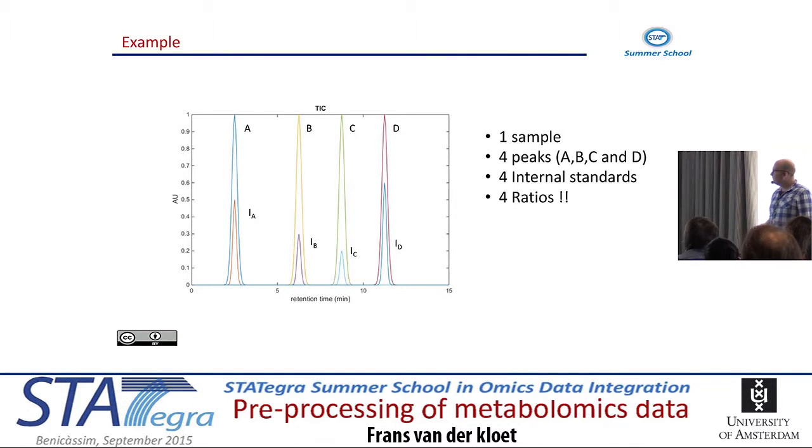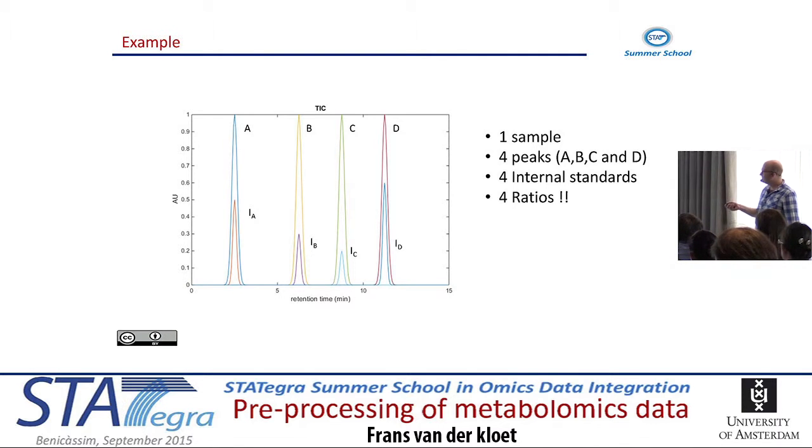You shouldn't make it too complex, because if you add a lot of internal standards, you influence your own measurement again, and you will easily get detector saturation and things like that. So that's a hard thing. We are busy with some nice experiments, working on it right now, and they show some nice results to do it in a different way. But well, I can talk to you about it later.